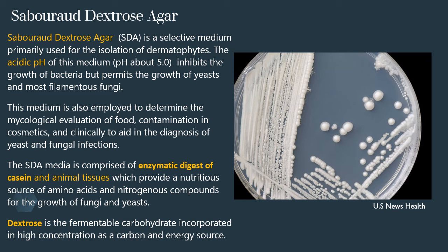That's why SDA is widely used for isolation or screening of fungi like Aspergillus and Candida. Both can be easily grown on SDA.